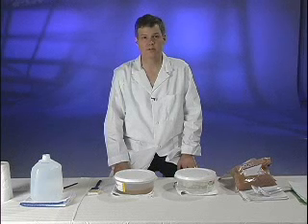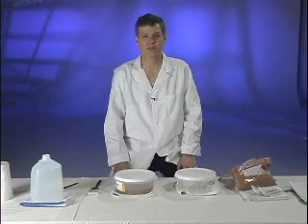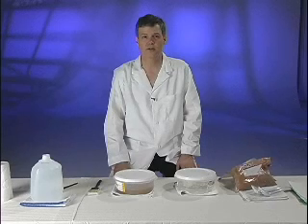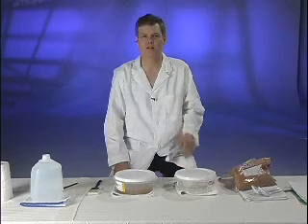The first thing you must do is prepare what 19th century pharmacists called butter of zinc. This is nothing more than adding water to crystalline zinc chloride to create what will appear to you to be a very thick oil.